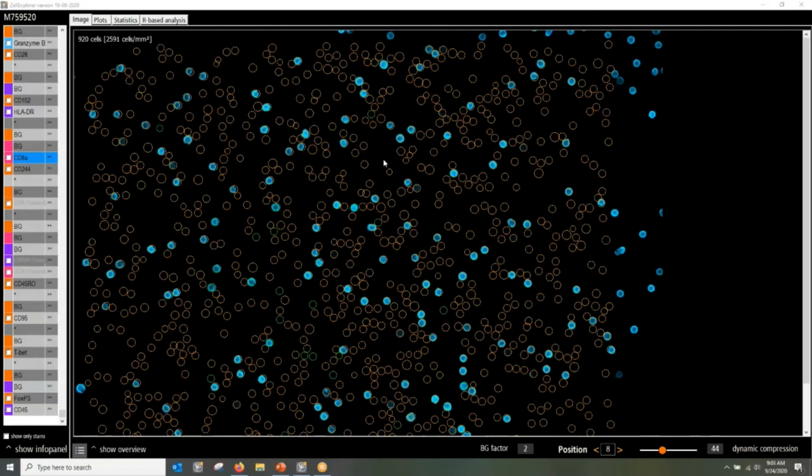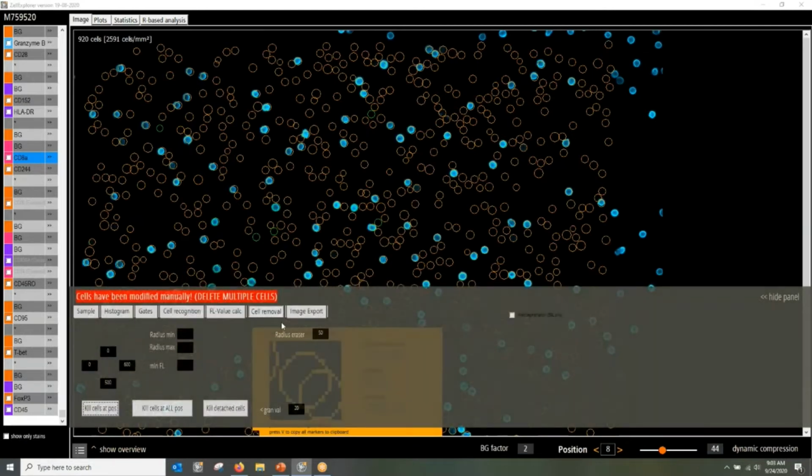This video will cover the tools we have for erasing cells from an analysis binary. We'll find the Show Info panel in the Cell Removal tab. There are two ways that we can remove cells.